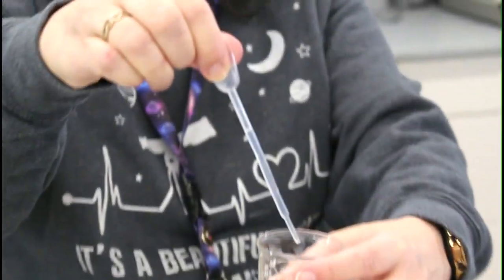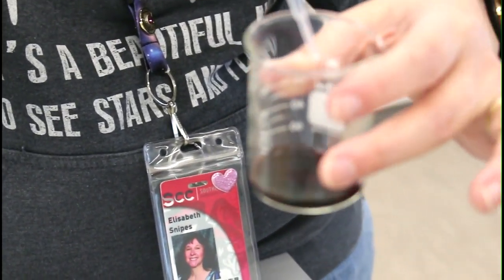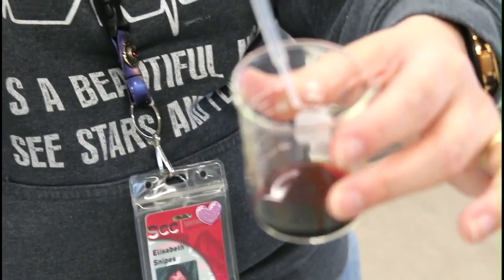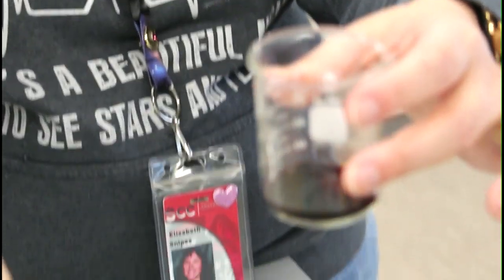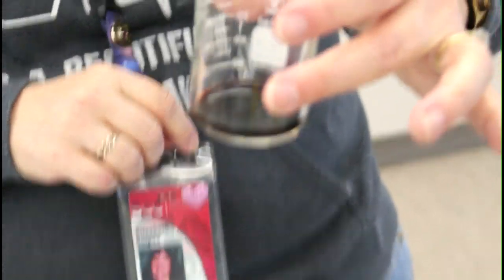Whoa, I love that. What happened, Mr. Wizard? It's a chemical reaction. It's forming that thiocyanate complex, iron 3 thiocyanate, and that complex is like a deep blood red. Yeah, that's crazy. So record your observations.